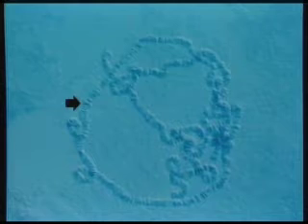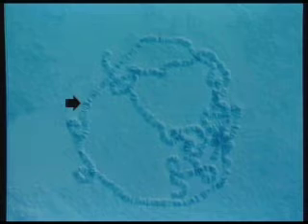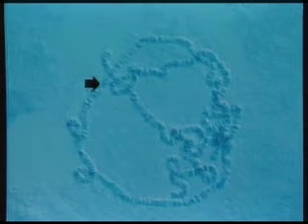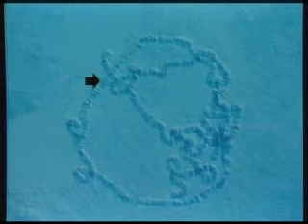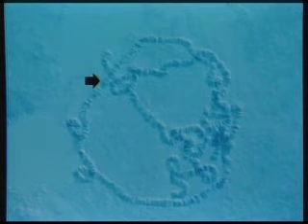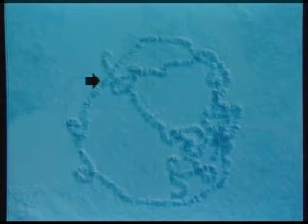This is a light microscopic image of a single chromosome. Now, this is not your typical chromosome. Most chromosomes are quite small. This is a giant chromosome taken from the salivary glands of the fruit fly Drosophila. And I show it to you just to show you the characteristic banding patterns that you find on Drosophila chromosomes. The fruit fly has been used for many years as a genetic tool, and one reason it's such a good genetic tool is because it has large chromosomes in which you can see different banding patterns which sometimes reflect different patterns of gene expression.